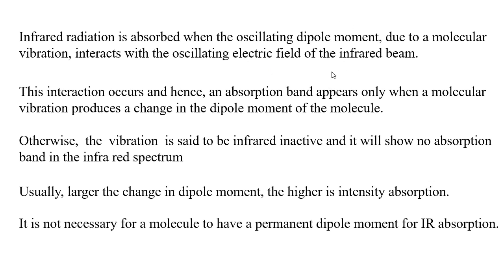When these two factors interact, then the infrared radiation is absorbed by the molecule.